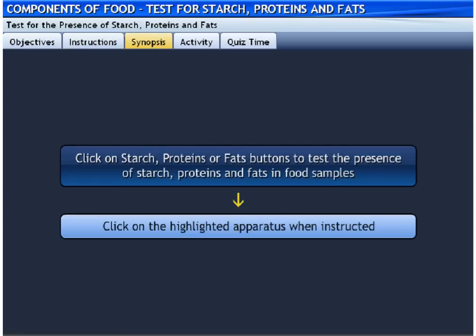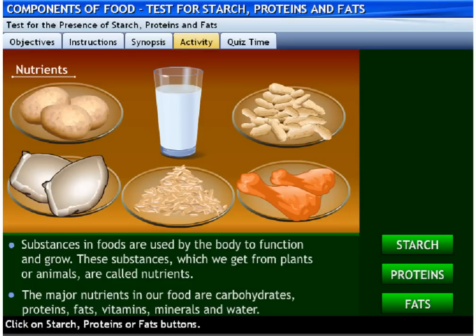Please go through the synopsis of the activity. Click on the starch, proteins, or fats buttons to test the presence of starch, proteins, and fats in food samples.